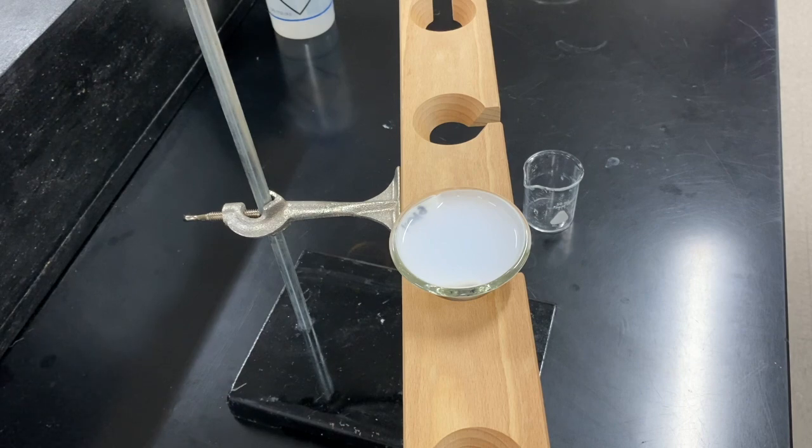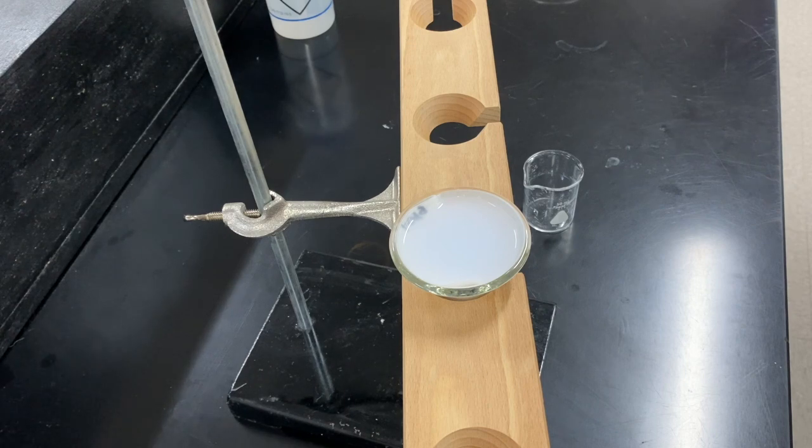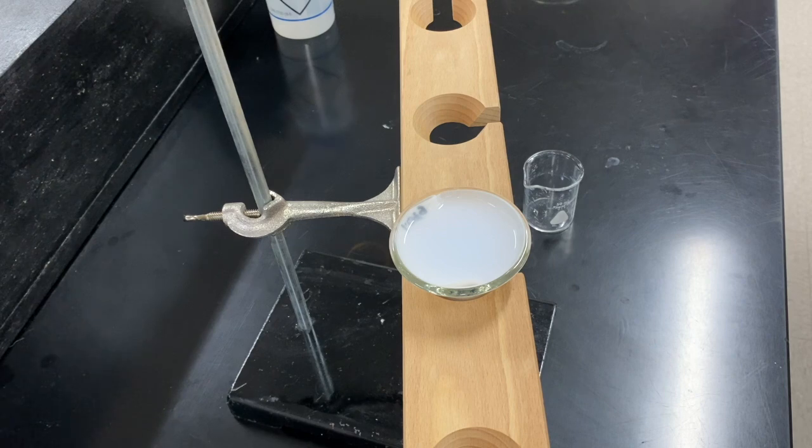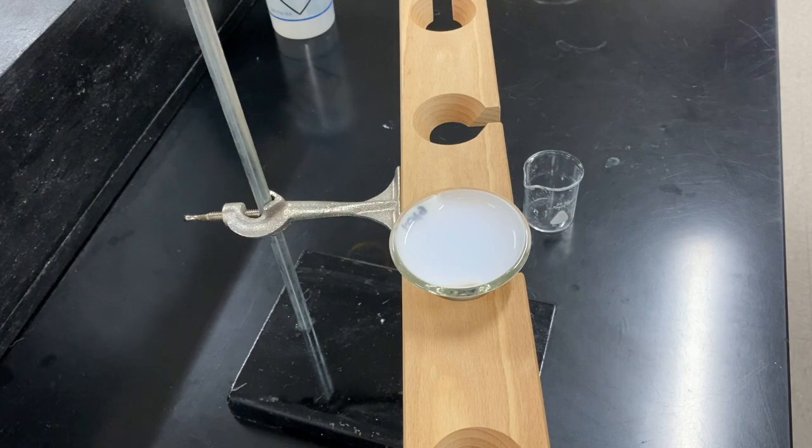And then once we're done filtering, we're going to then move on to the last stage, which is to dry the filter paper so that we can determine the mass of the precipitate that was formed.